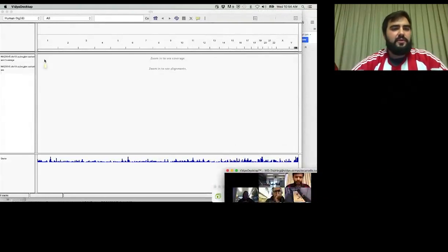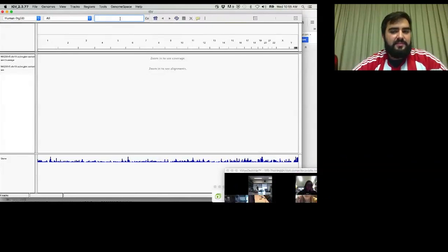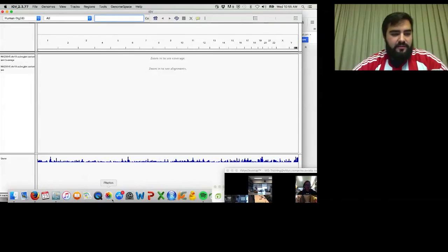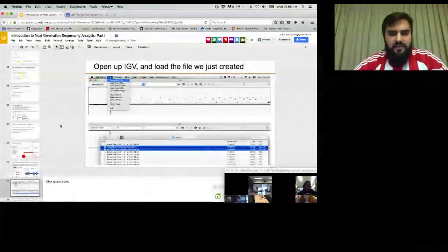You can see, if you're new to IGV, across the top we have the different chromosomes. You can type a region or a gene into the text box here, and that will take you to that region or to that gene. This track here at the bottom represents the different genes, and when we zoom in, that will make more sense. And so I believe I have directed you to a given region.